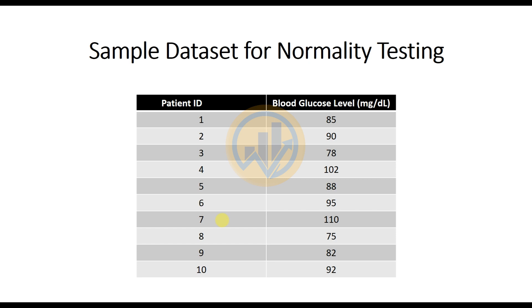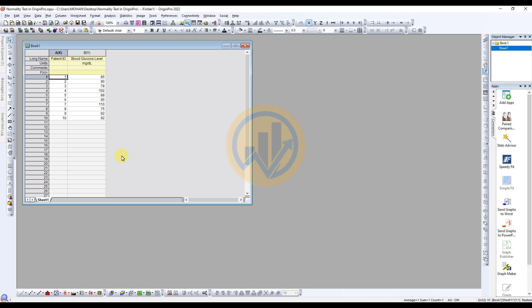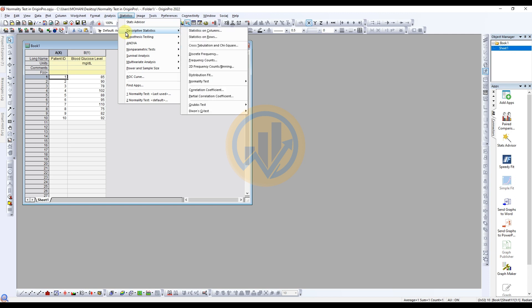Open the OriginPro software. The data is already entered in the OriginPro workspace. X is for the person ID and Y is for the blood glucose level in milligrams per deciliter. Now we will analyze the normality test, so go to the Statistics menu and select Descriptive Statistics.